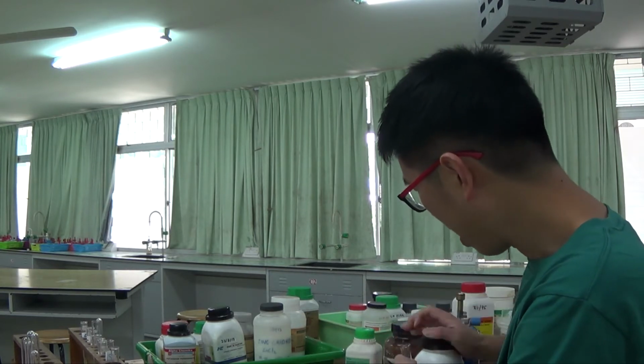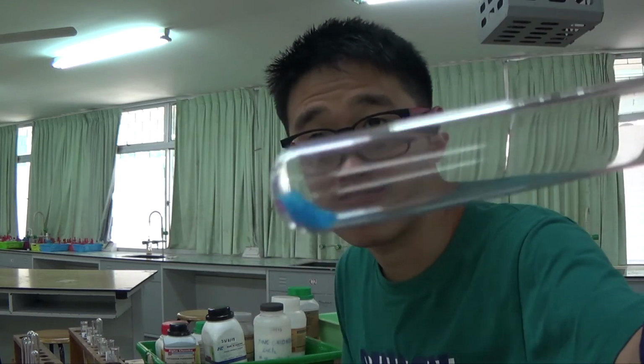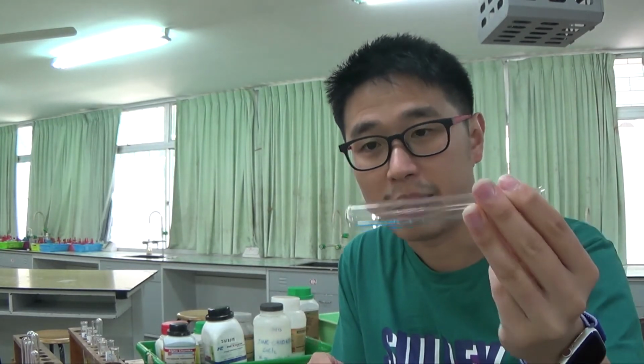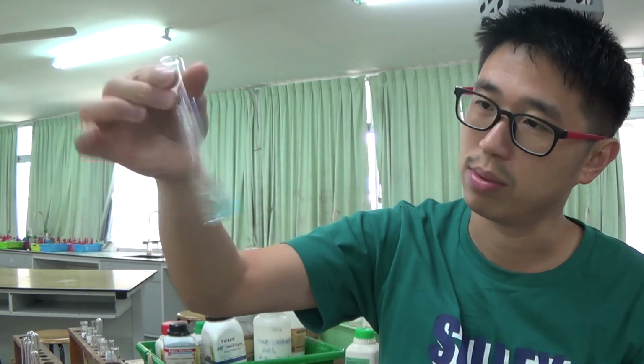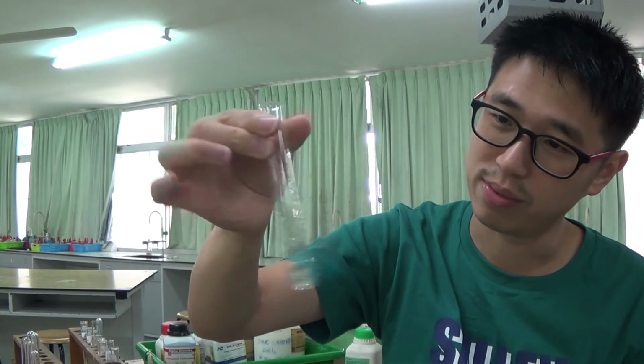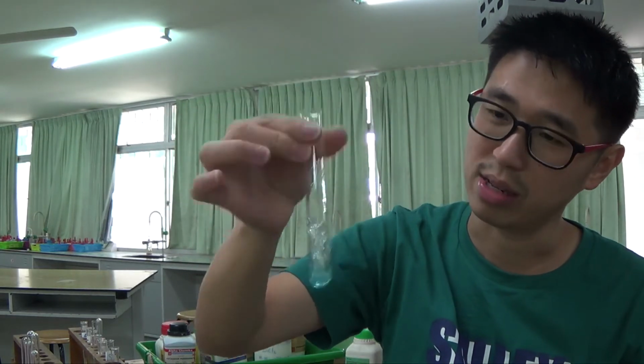First of all, colored solid, okay, that contains metal, which means metal cations. Most likely it's a transition metal cation, a transition metal compound, but then you need to test for it. So I'm just going to dissolve it in water. This thing is actually quite hard to dissolve in water. Okay, some of them already started to dissolve. Doesn't matter. Very crystalline solid, very beautiful crystals.